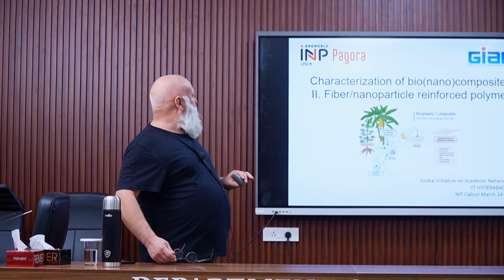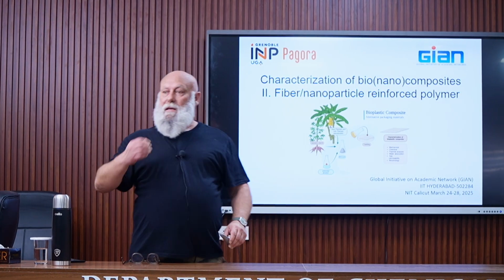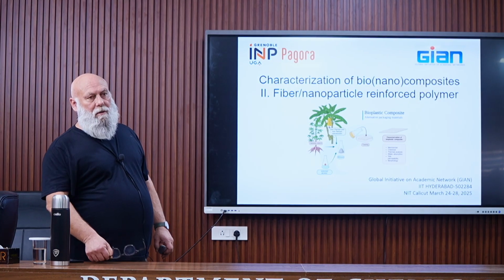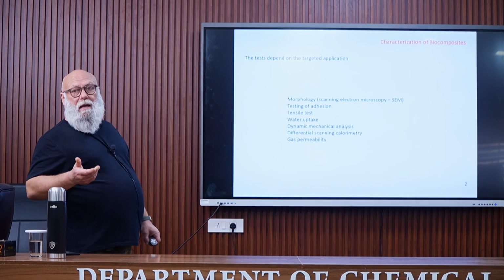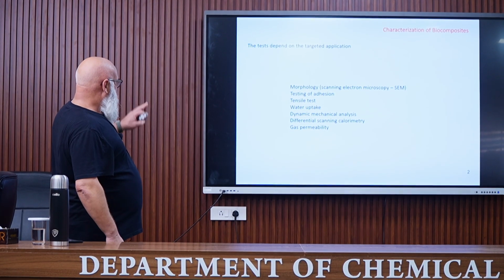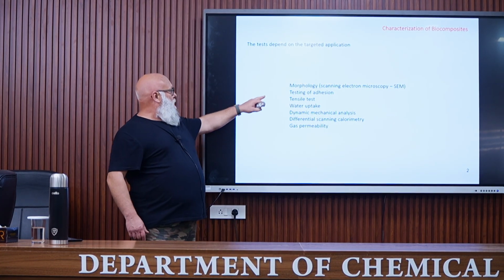So now we'll move to other techniques of characterization, but after associating the graft or ungraft fibers or nanoparticles with a polymeric matrix. So, of course, the test to be performed depends on the target application. I will show you some experimental techniques that can be used, the most used techniques.